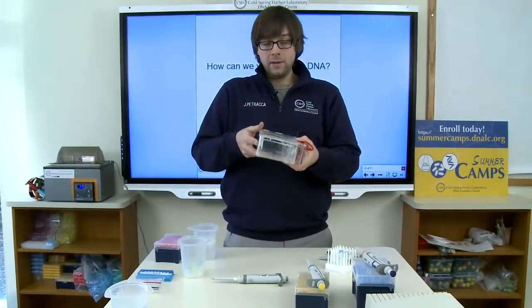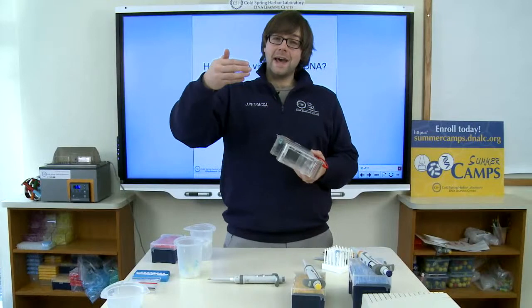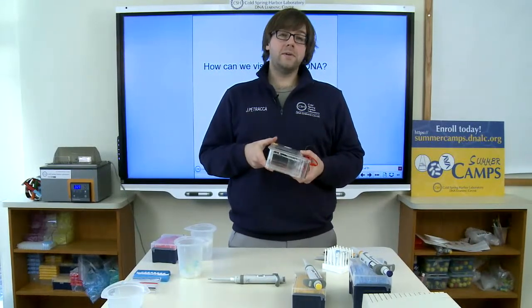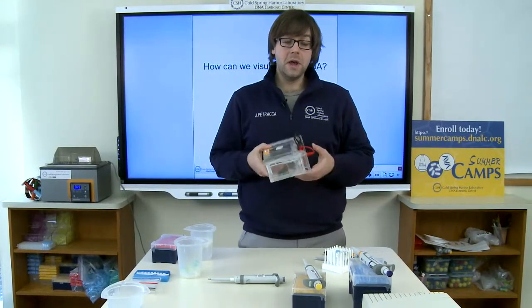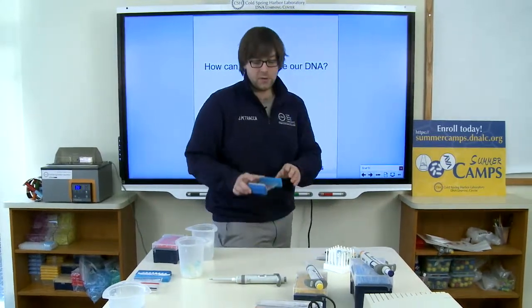And it's going to pull charged particles, such as DNA, through that electric field. And it's going to allow it to sort of separate those particles out based on their size. Okay, so the gel part of gel electrophoresis is called agarose.